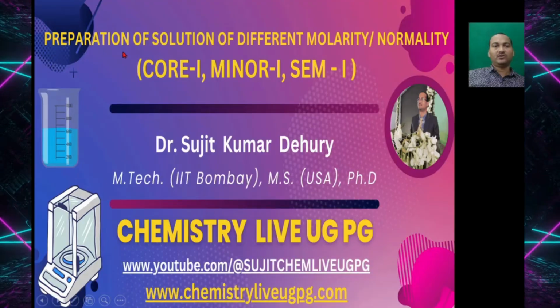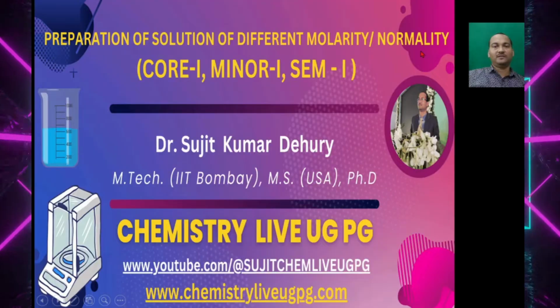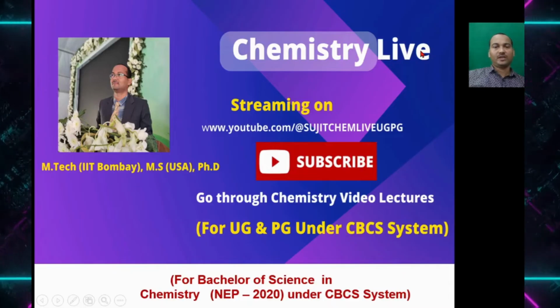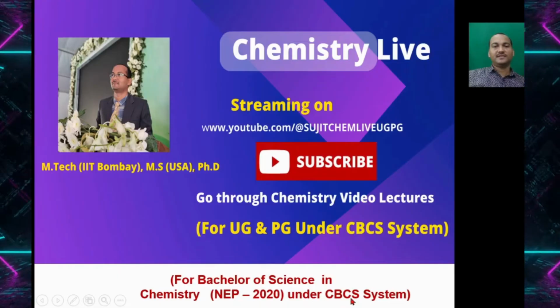So today we are going to talk about preparation of solution of a different molarity or normality. So this will be highly beneficial for BSc Chemistry students under CBCS syllabus.